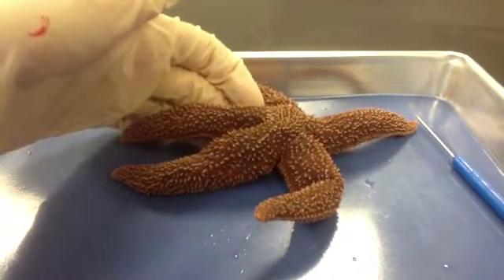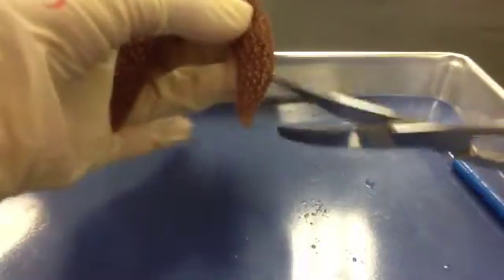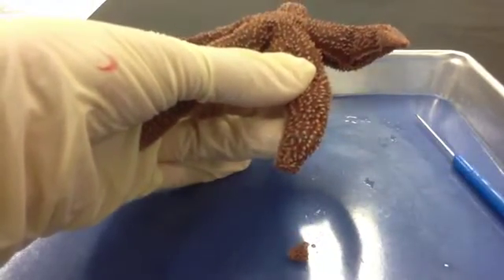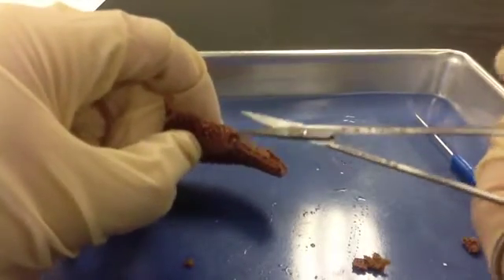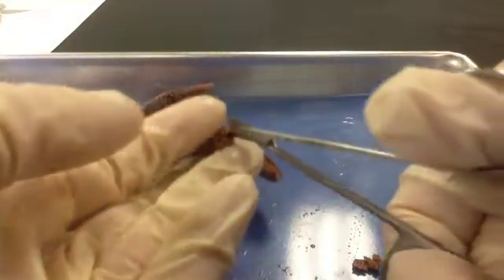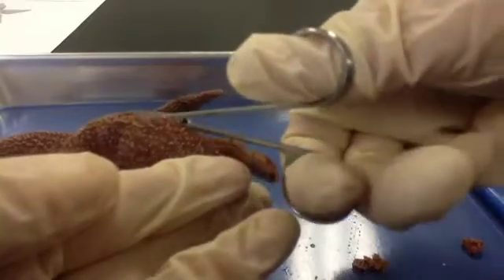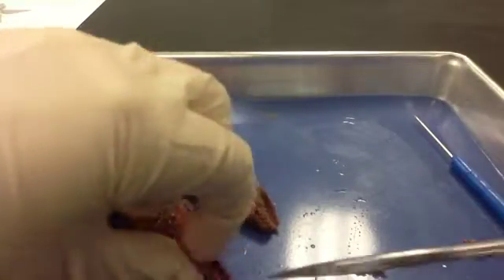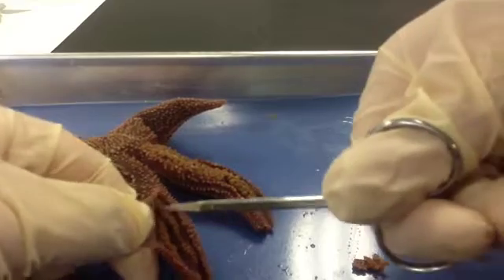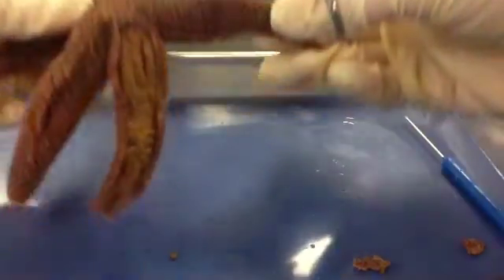For the dissection, we're going to cut off the tips of the rays to look at the internal anatomy. Pick a ray and cut off the very tip with your scissors. Now we're going to make cuts in the arm or ray of the sea star — start at the end where you cut off the tip and stay as close to the surface as possible so you don't damage internal organs. Cut slowly all the way up to the central disc, then cut along the other side as well, and gently pull up the skin of the sea star to reveal the internal organs. Use your dissecting probe if needed.